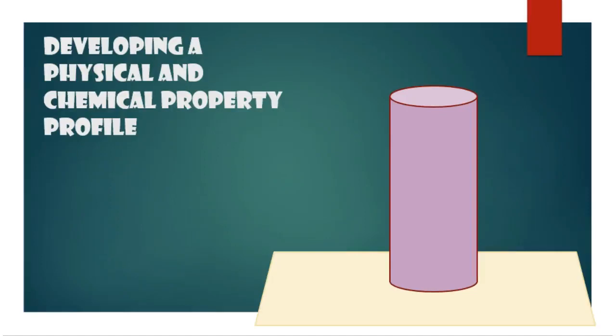So today you're going to be investigating an unknown substance. Now the tale is this. Someone has gone and put a white substance in one of the teacher's staff room's sugar bowls, and it caused quite a stir when those people used it in their coffee and then ended up spitting it all over the place and over each other. So someone has gone in and done a really nasty trick, and you have to figure out, number one, what was the substance, and then later on you're going to be able to try and figure out who put it there.